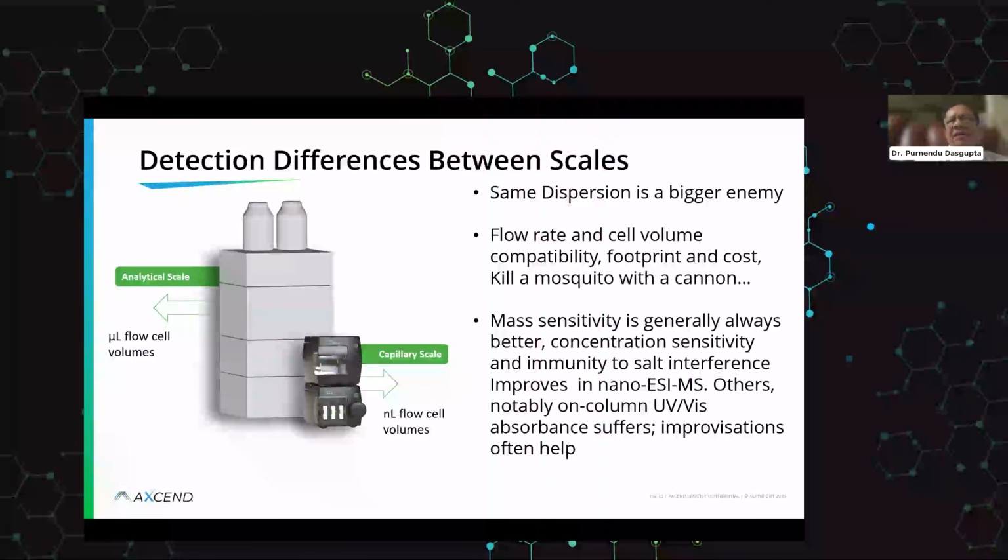Then there are other concerns. These guys did these wonderful things with an Orbitrap Lumos. It's only about $1 million plus some change. So if you have that kind of pocket change, you do it, but you're not going to carry it out to the field. Depending on your need, you may be bringing in a cannon to kill a mosquito.